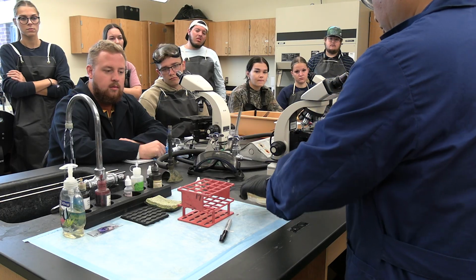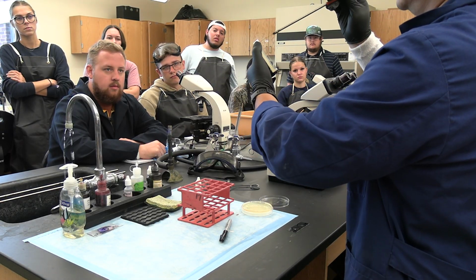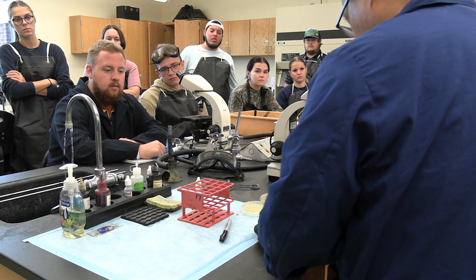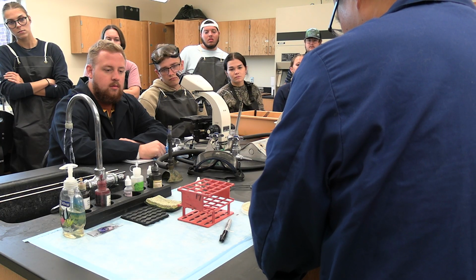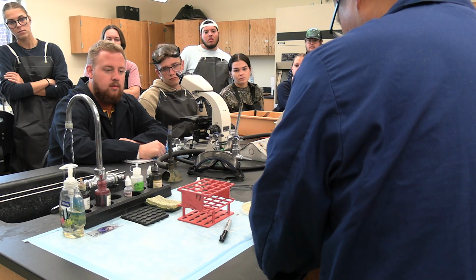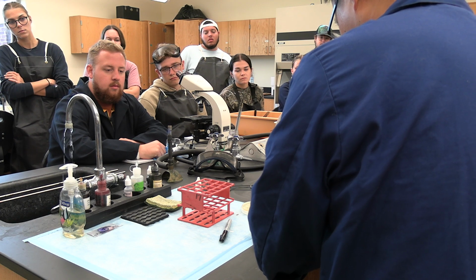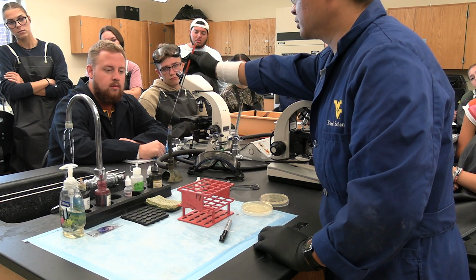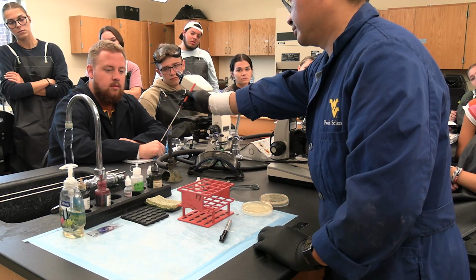So we have 2 slides, 2 plates. First of all is E. coli. Cool down the loop a little bit, pick some smear. E. coli is right here. Make a big smear of E. coli, nice and gentle, and cover the circle, but also make sure it's thin. Now you have to flame it, because we have to kill the E. coli before adding the E. faecalis.